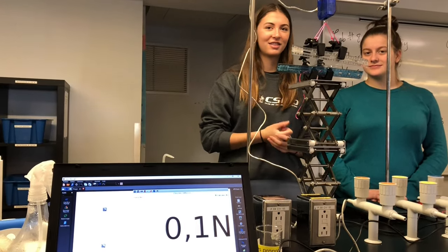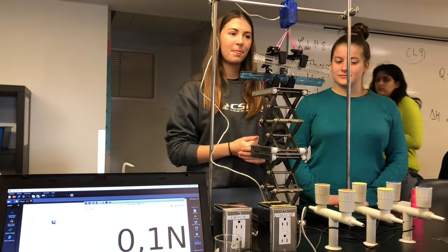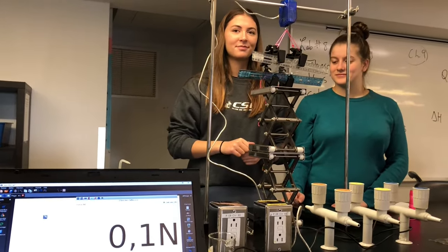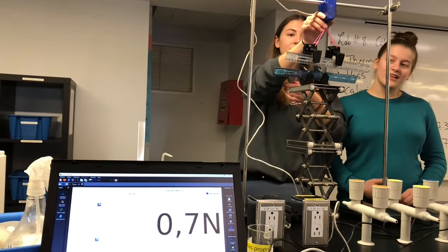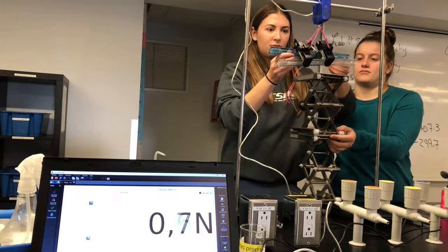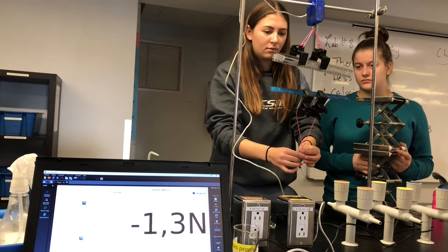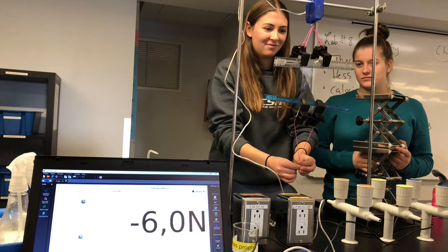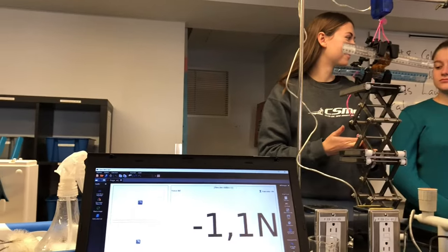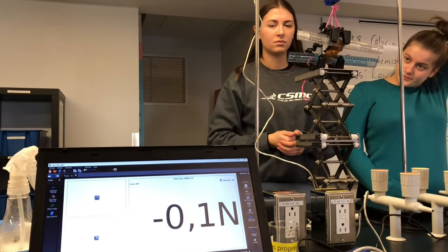We're going to test the resistance of our cling wrap plastic compared to our bioplastic by applying a force and seeing how much force it needs to break apart. Marion is going to calibrate the software by pressing zero, then calibrate again for our bioplastic to test its resistance.